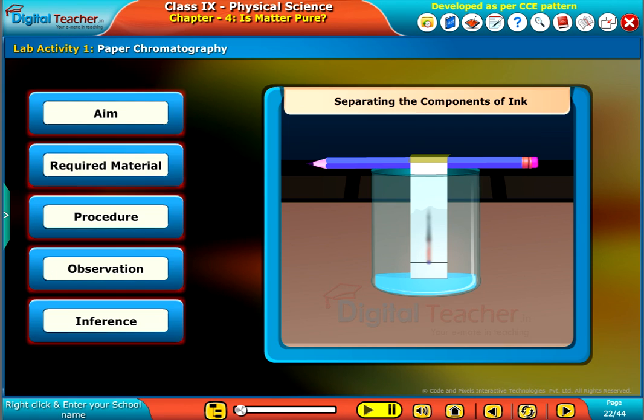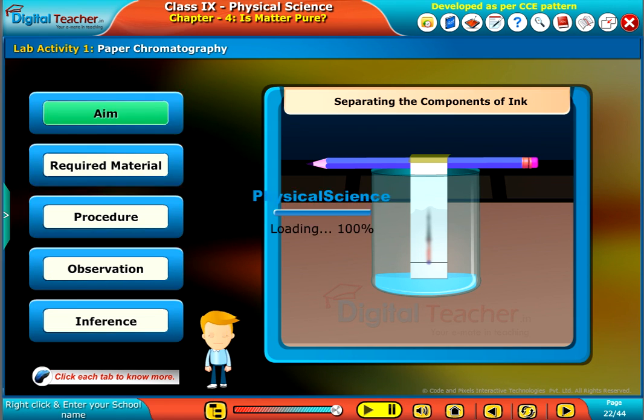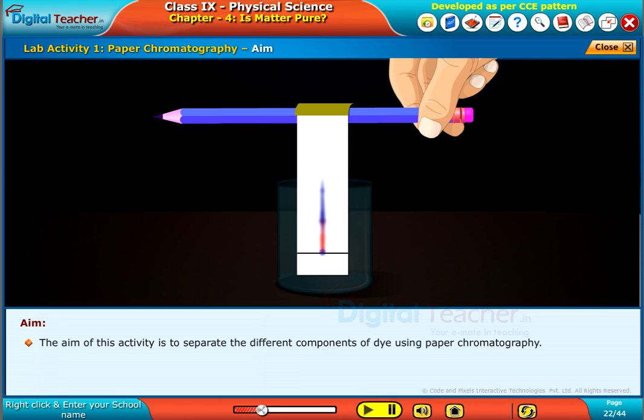Welcome to the chapter. Let us do a lab activity to separate the different components of dye using chromatography. Click each tab to know more. The aim of this activity is to separate the different components of dye using paper chromatography.